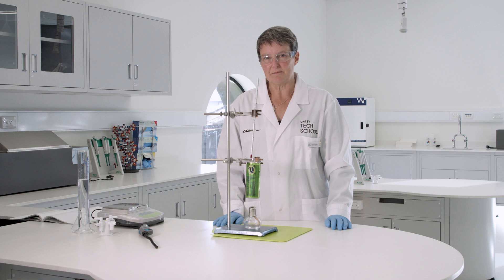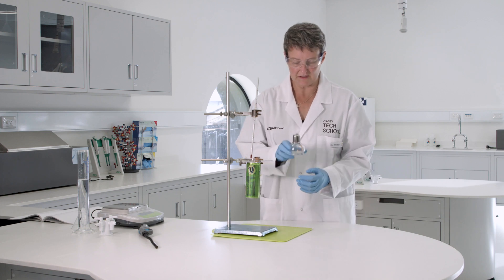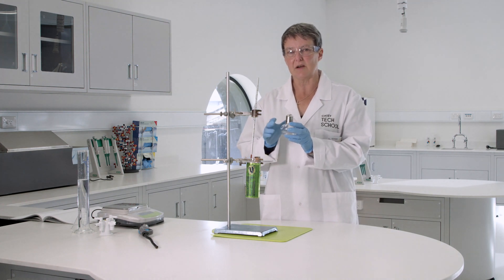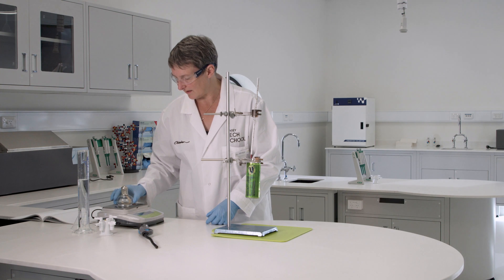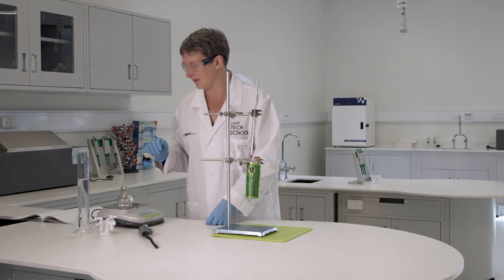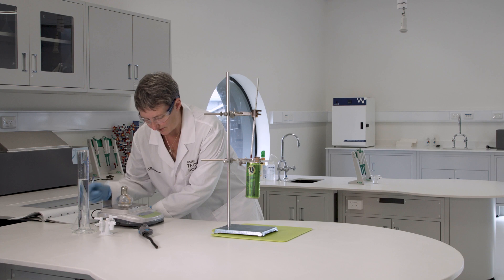Earlier we made some biodiesel. Now it's time to check the quality of the biodiesel, and we can do that by measuring the amount of energy output from a combustion reaction. In here I have my biodiesel — just a very small amount, about 10 mils, put in here with a wick. To do the calculations I need to get some mass readings, so the first thing I need to do is measure the mass of my biodiesel, because I need to know how much of the biodiesel has reacted in the combustion.